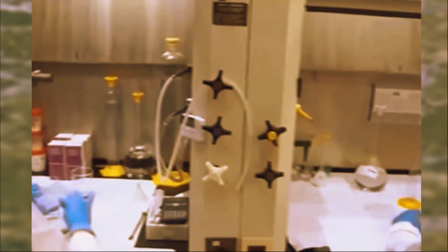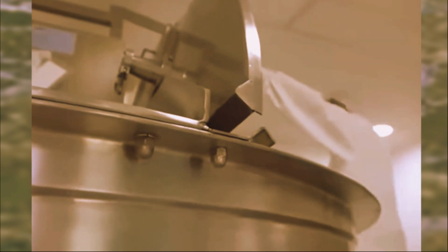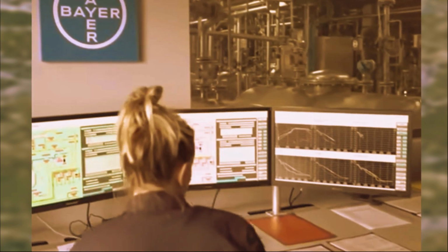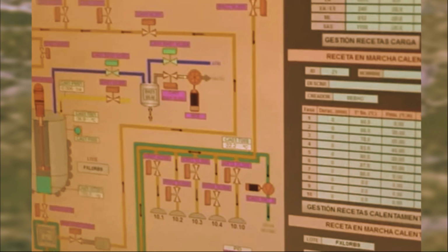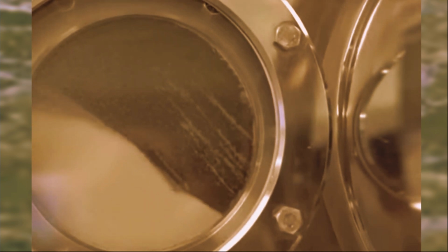First, our aspirin soup of crystals and ethanol gets transferred to a big tank with a built-in stirrer. This keeps all the crystals nice and evenly suspended in the liquid. Then the whole mixture gets pumped into the filter. Inside, the liquid gets separated from the solids, and pure aspirin crystals are left behind on the filter, while the leftover ethanol is collected separately.